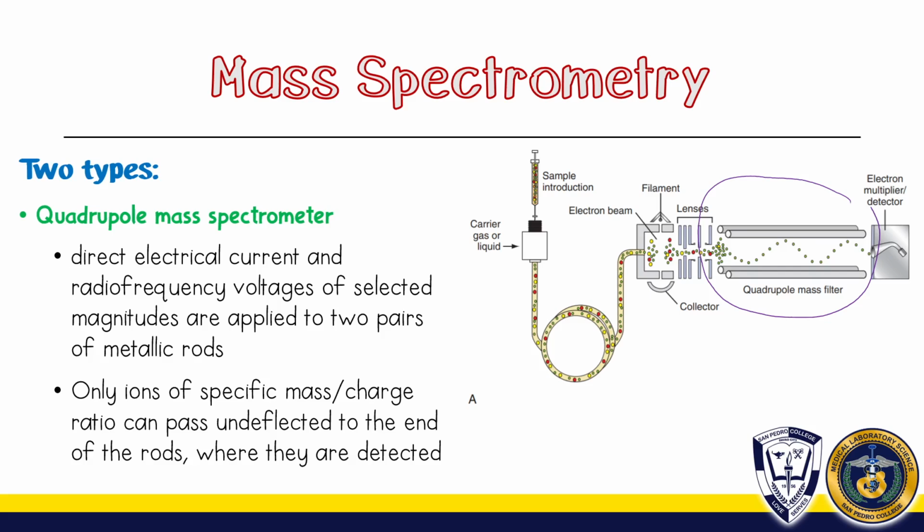So to better understand how your quadrupole mass spectrometer and how its component will work, so tanaw na po ta og video ha.